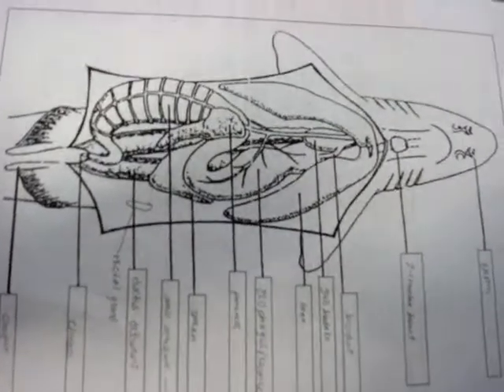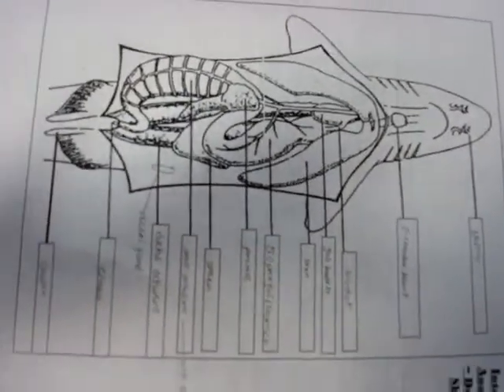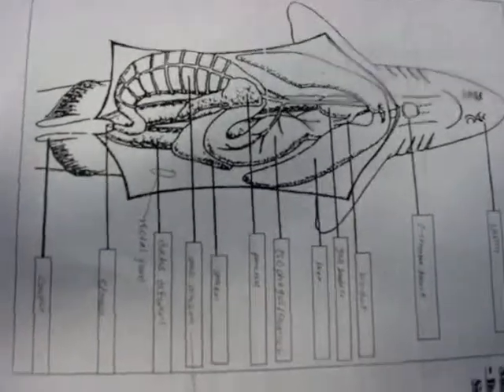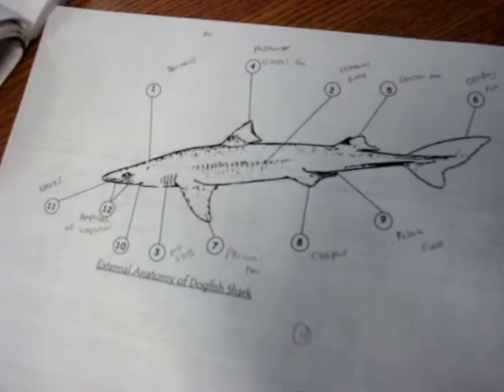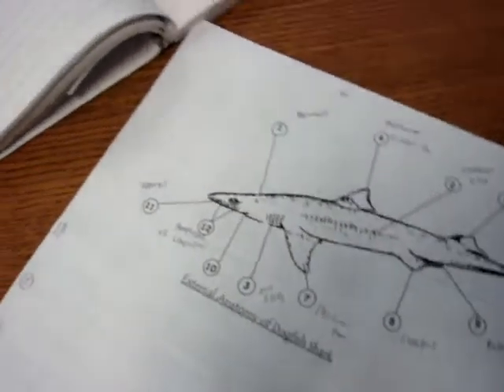This is our final product. Label. It smells amazing. If we take our probe and we put it in the spiracle.